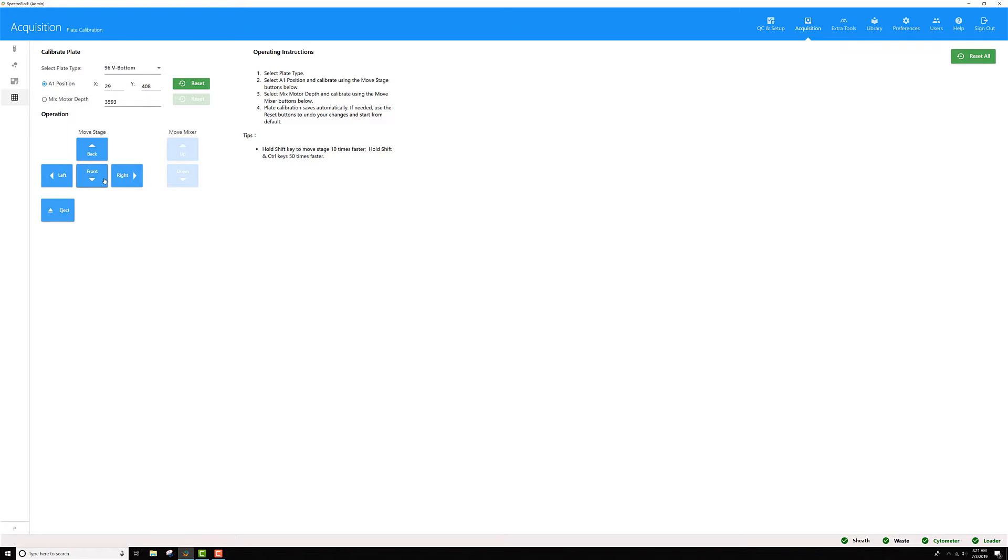Move it back and front until you get it roughly centered. It doesn't have to be perfect. With the 96 wells, the wells are fairly big, so there's a lot of room for error. Once you're happy with your A1 position, go ahead and check the mixing motor depth.